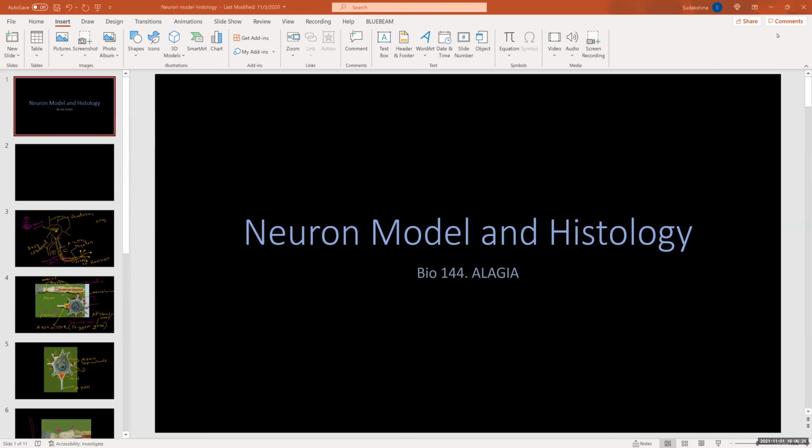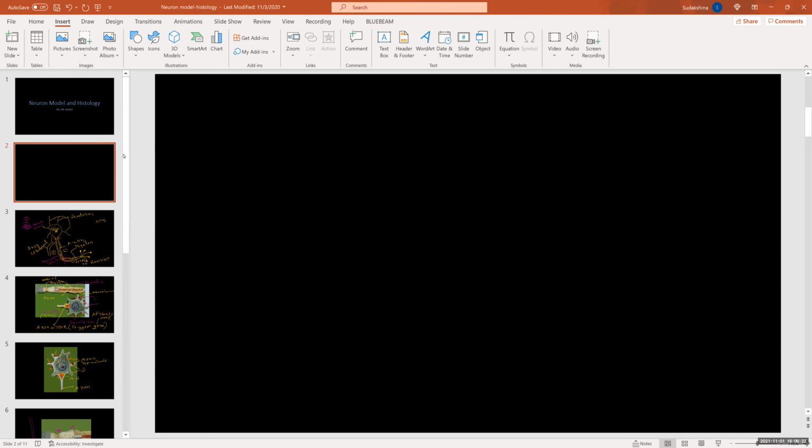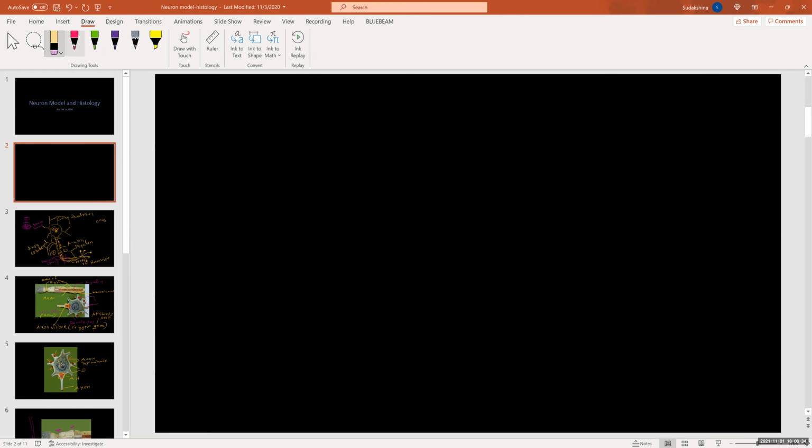Okay, class. This demo is for neuronal histology using a neuronal model and histology images. Okay, so neurons, first of all, when you say nervous system, the nervous system is made of what we call neural tissue. We'll talk about this in physiology pretty soon. Neural tissue is basically the tissue that makes up our nervous system.